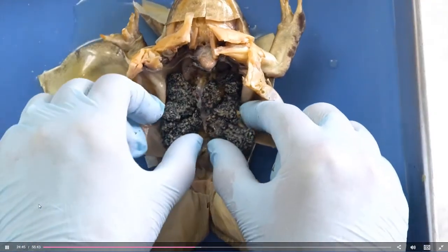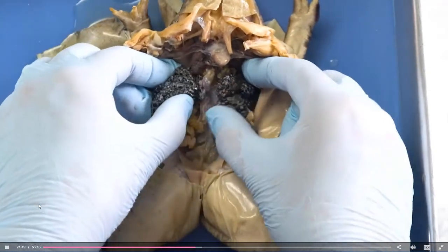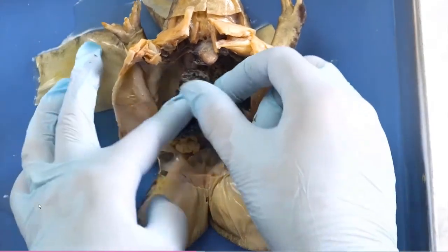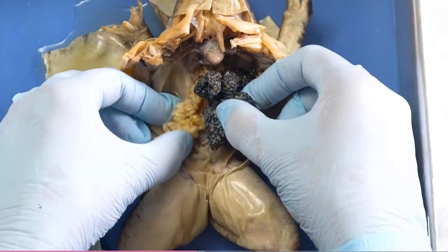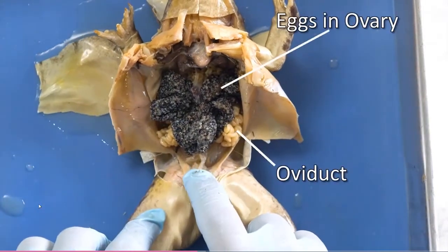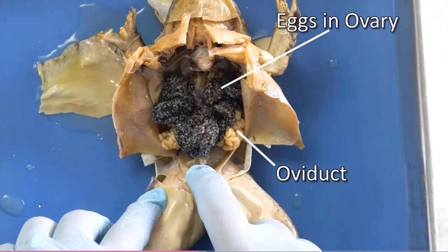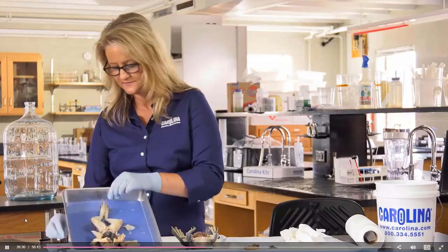Female frog, we see this large egg mass on both sides, which would be in the ovaries. And then we see these beautiful oviducts that lead to the cloaca and would allow this urogenital opening of the cloaca, which we've removed, to release the eggs into the environment. Here's our male frog.